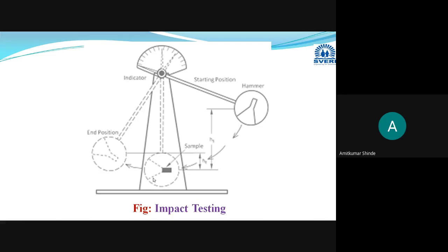And please complete the drawing here. Okay, this is the arrangement for conducting the impact testing. This is the base. You can see it clearly. This is the base, and one anvil will be there.